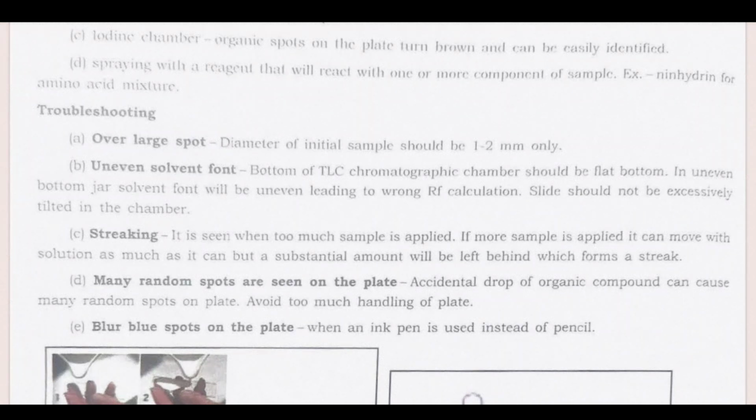Streaking. It is seen when too much sample is applied. If more sample is applied, it can move with the solution as much as it can, but a substantial amount will be left behind, which forms a streak.